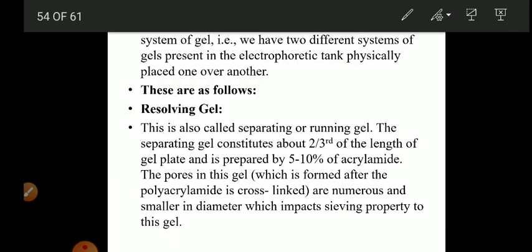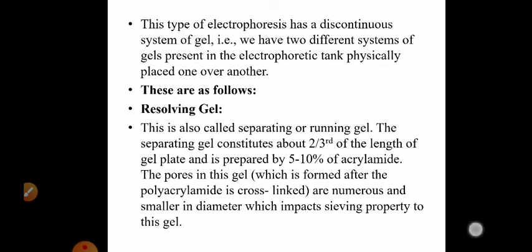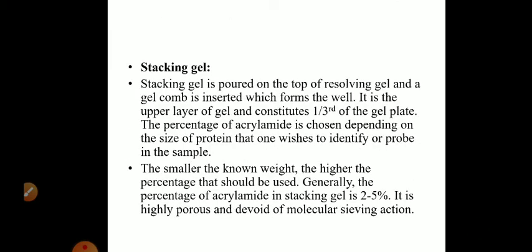Sieving means what? In Hindi we call it chhanna, filtering. So a sieving effect, right? Small molecules move faster, large molecules move very slowly, or they get retarded. So proper separation on the basis of molecular mass, molecular size, will occur.